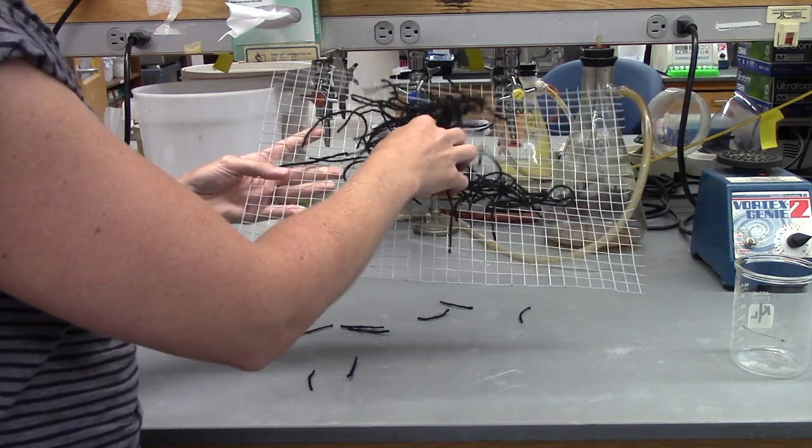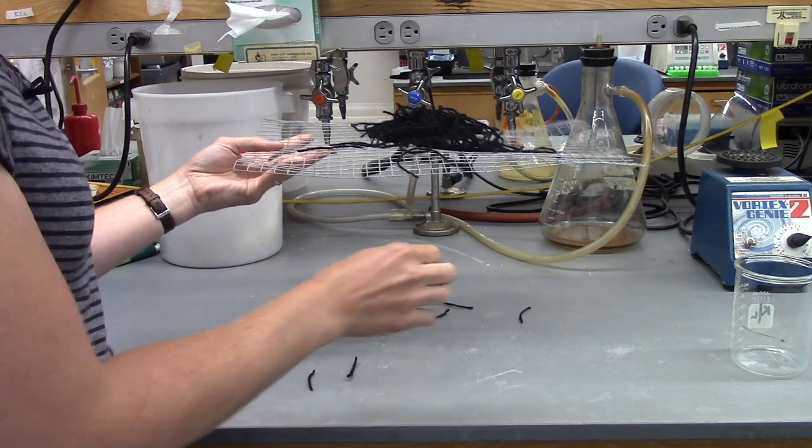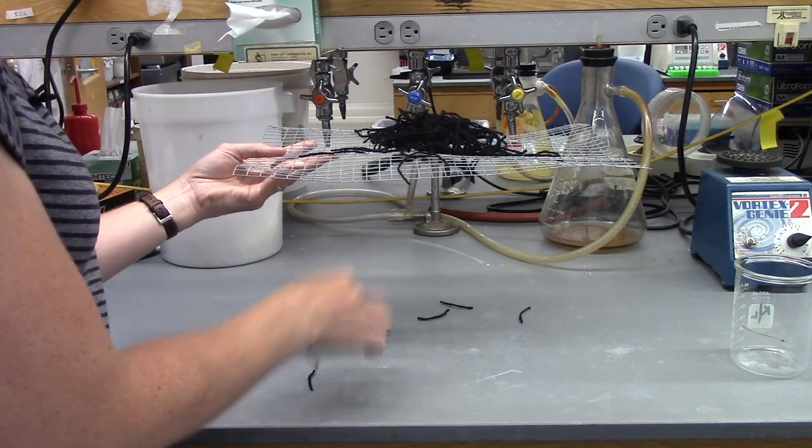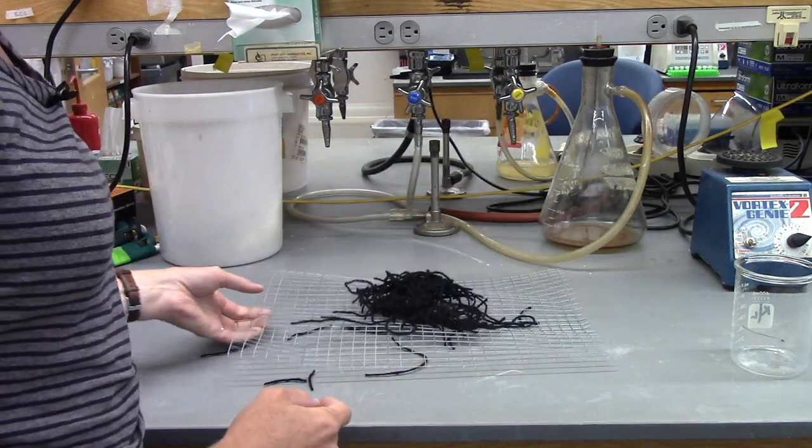Now, gel electrophoresis is actually more like multiple layers of hardware cloth, so the little ones sneak their way through, and the long ones, it takes longer for them to make it all the way through all the layers of the mesh.